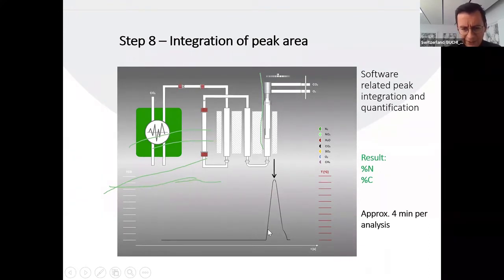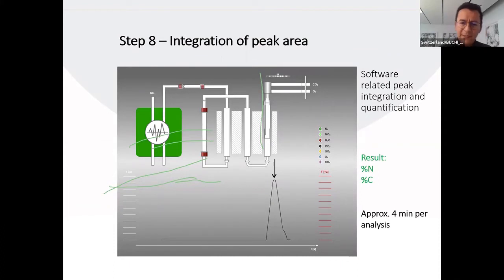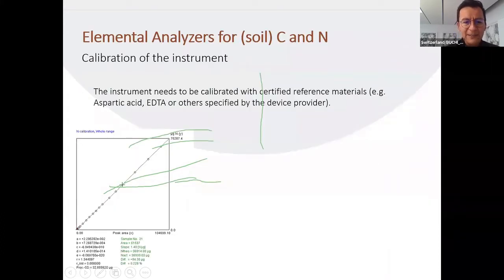At the bottom of this slide, you see a spectrum of thermal conductivity compared to the thermal conductivity of the helium. Based on the peak that you see there, you can quantify nitrogen. This is really good because it only takes around 4 minutes per analysis. The way it is quantified is that you put that peak into a mathematical function. You compute the peak area and relate it to the content of nitrogen or carbon in the samples. If you have calibration standards, you can do that job of converting peak area into nitrogen or carbon.